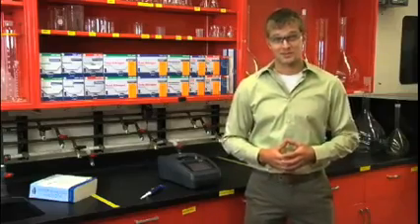How much time do you spend fumbling with reagents, or cleaning glassware, or rerunning tests to ensure accurate results?